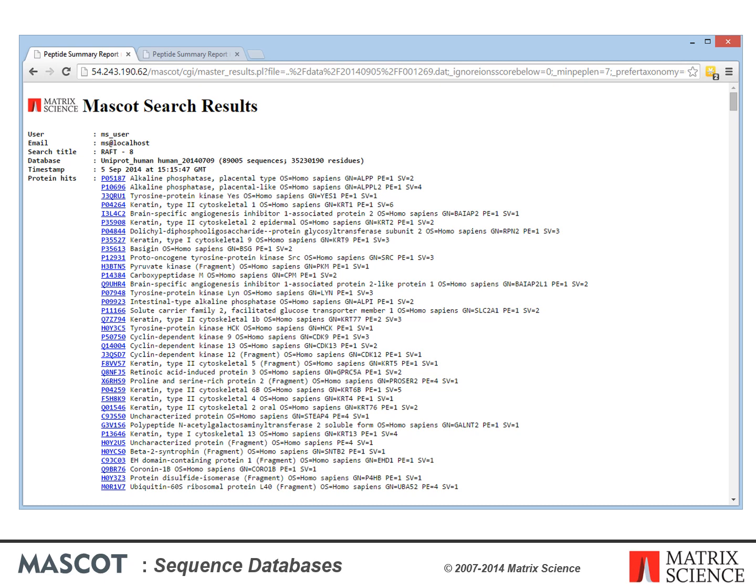To illustrate the features of the different types of database, we first searched a very small dataset of a few hundred MSMS spectra against a protein database, the UniProt Complete Human Proteome. There are significant matches to some 36 human proteins.